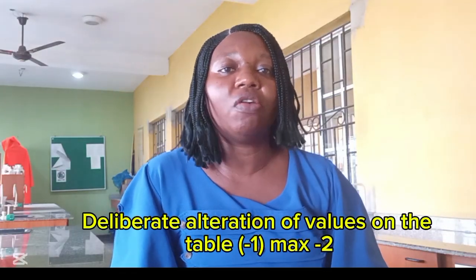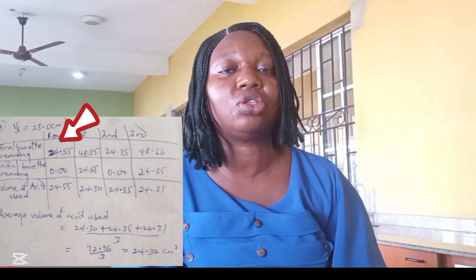The next thing is deliberate alteration of values to agree with the teacher's titre. When you are writing on your table, you have to be very careful. Don't change 8 to 6, 6 to 8. The moment we see any alteration, especially when the alteration tallies with your teacher's value, we penalize. So for each alteration, -1 will be deducted, up to a maximum of -2.